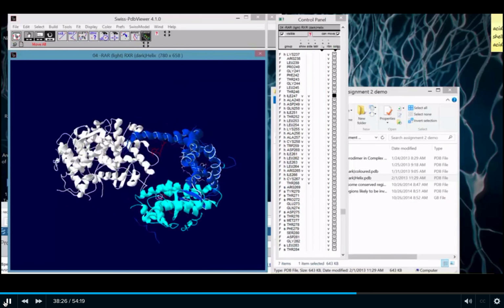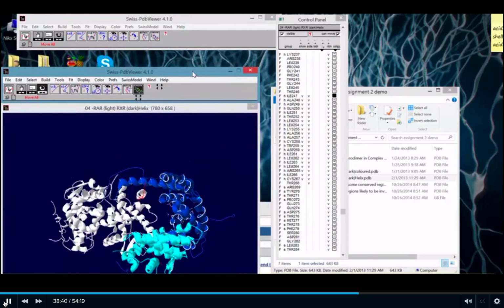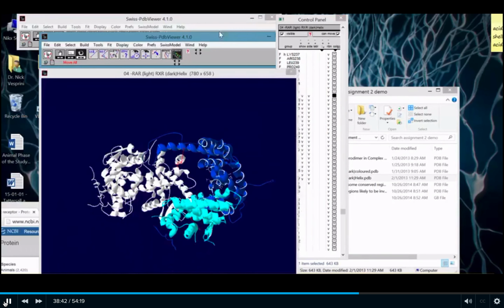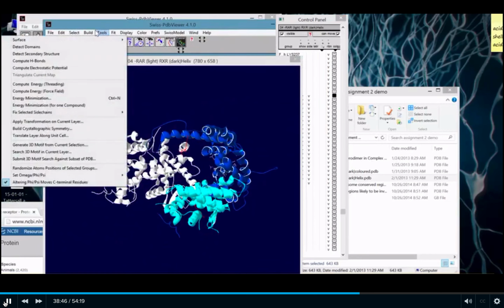Deep View does not accommodate or account for the presence of other atoms here. So in a sense, you've got two parts of a protein that are overlapping. So I have to justify that this is a likely conformation to go into. The way to do that would be to look at folding as one potential mechanism. So I can actually go into Tools, and Tools gives me a huge bunch of analytical tools.